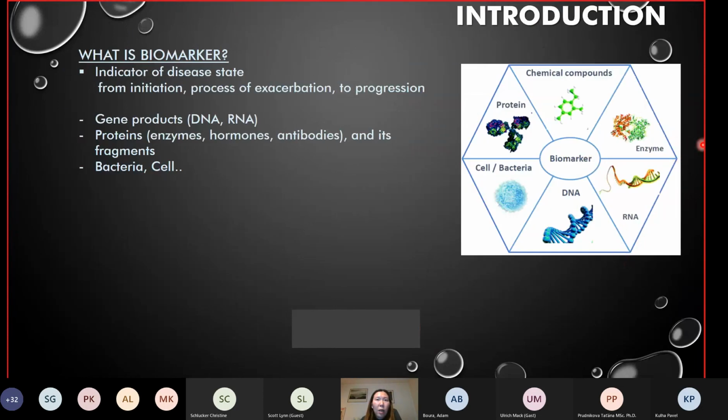But now I would like to use this AFM not only for imaging or to figure out the interaction with other biomolecules. We can also use our AFM as a detection method. Nowadays, there is a lot of interest and technology development to detect different biomarkers.